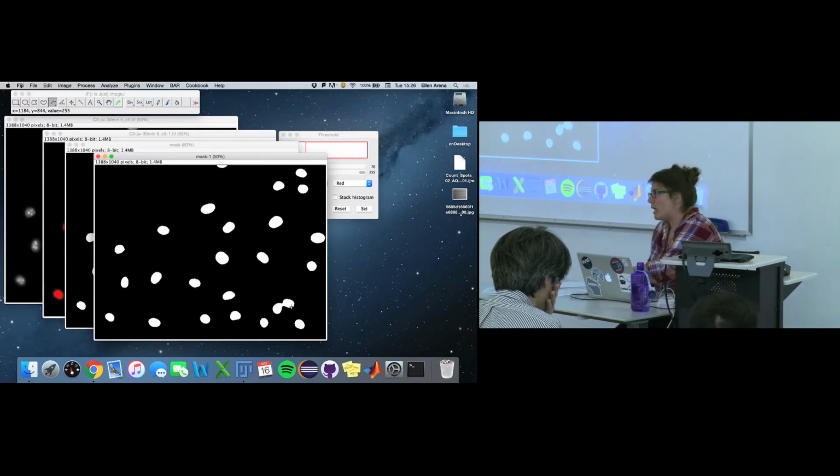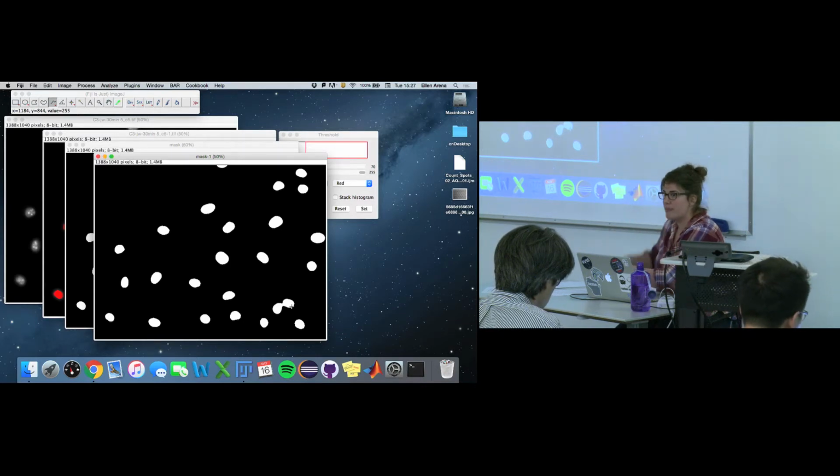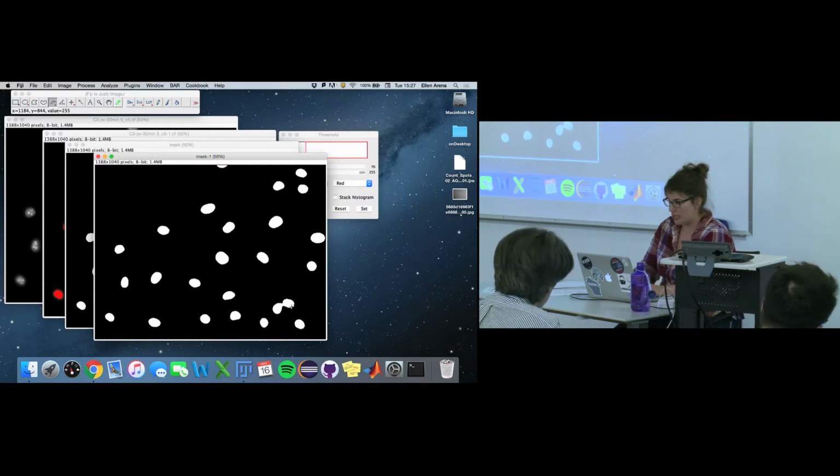Essentially, it works best on circular objects, because it's looking for the concavity between the 2, and will draw a border between them at the minimum possible distance between the 2 objects. That's essentially what watershed is doing. So let's do that now.